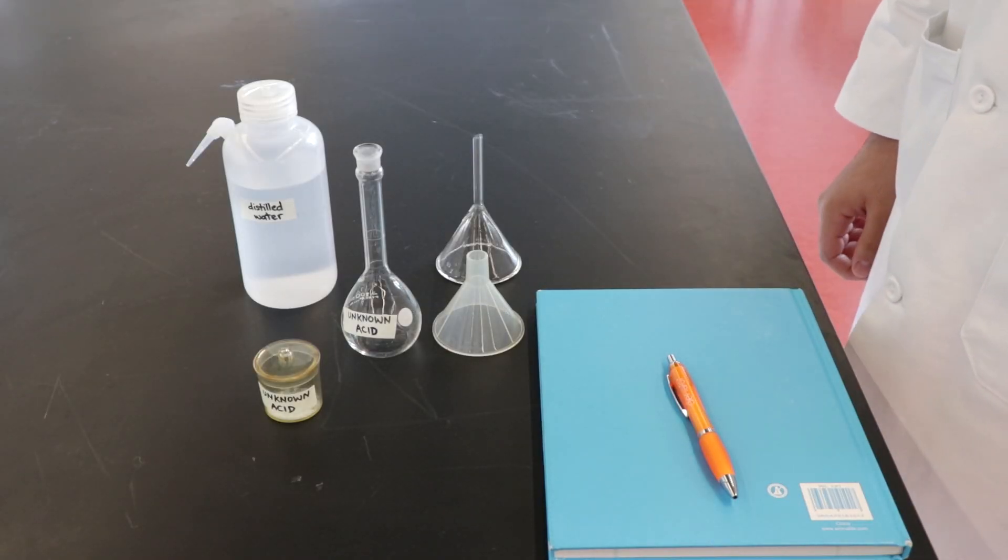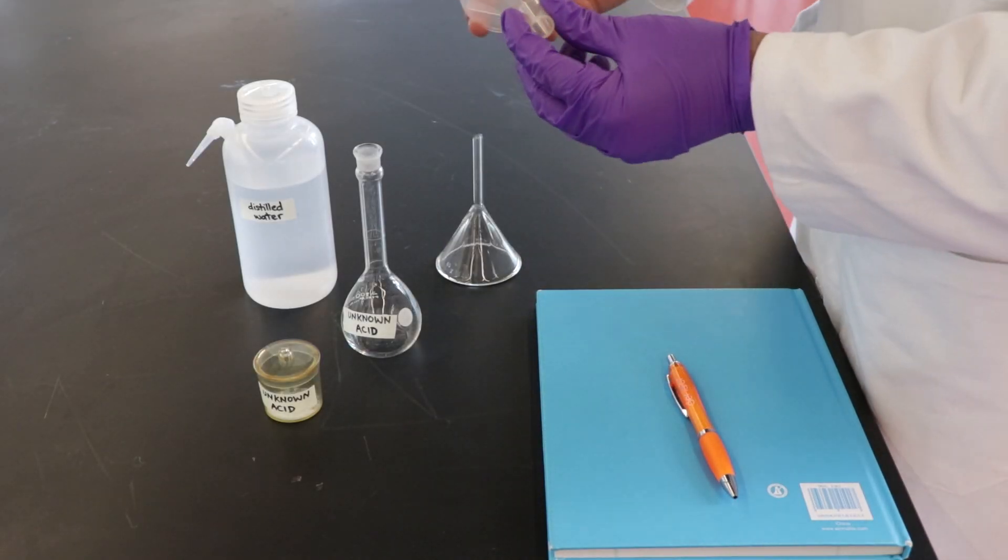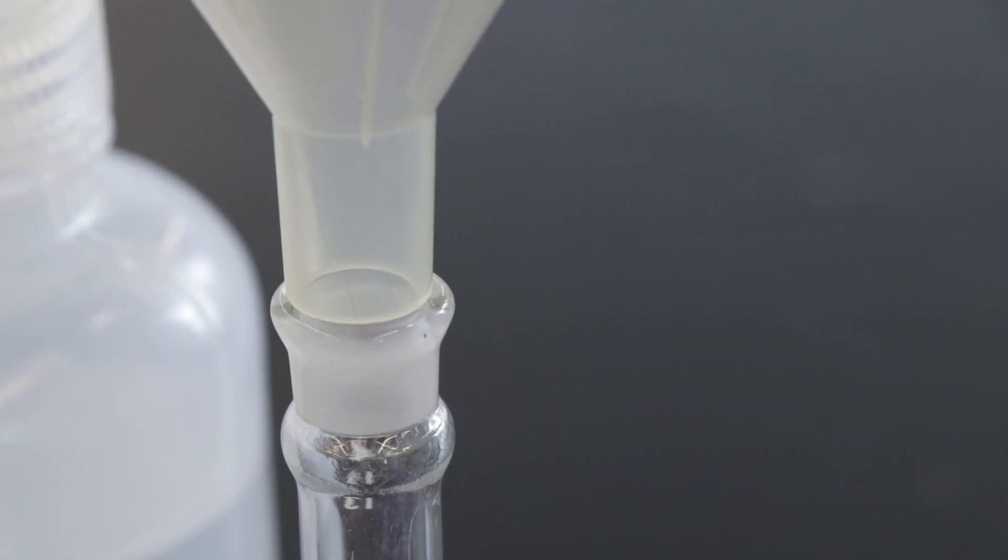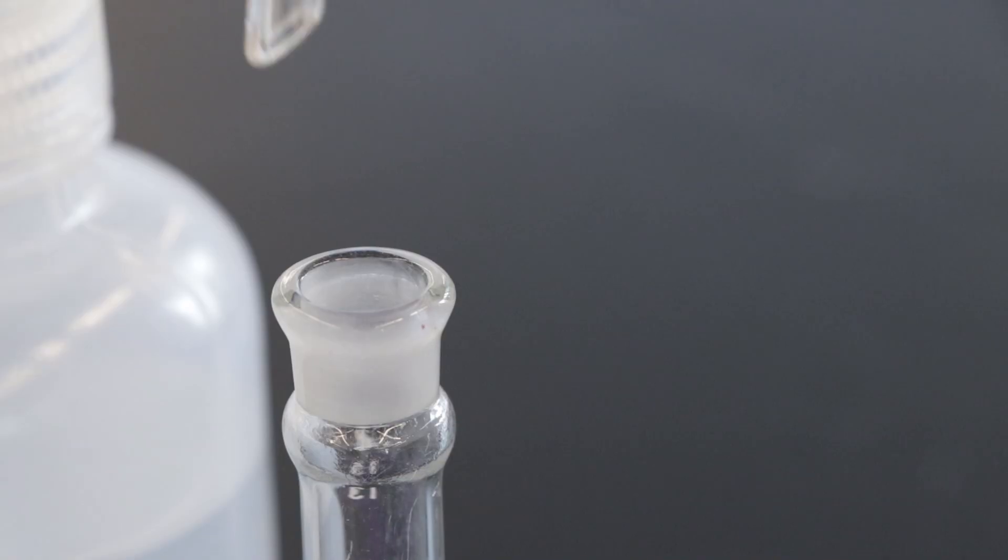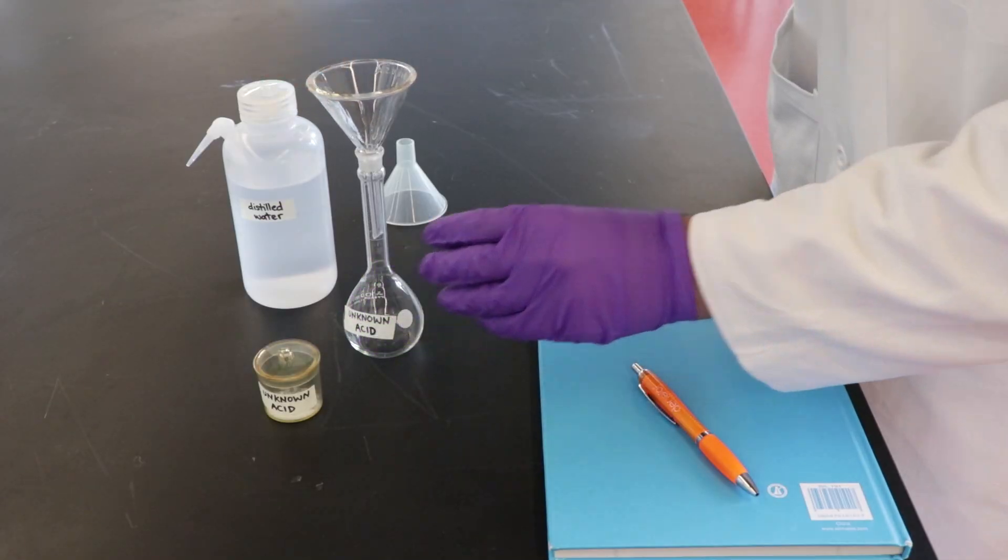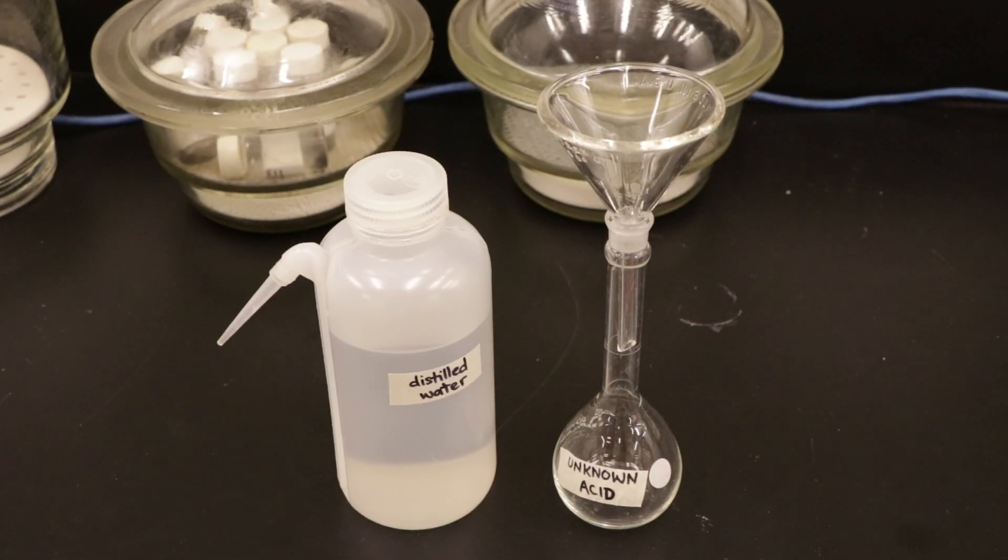This is the equipment you will need to bring with you to the analytical balance room. You may use a short stem funnel if the powder funnel in your drawer does not fit your volumetric flask. In the analytical balance room, place the volumetric flask, funnel, and wash bottle on the counter opposite to the analytical balances.